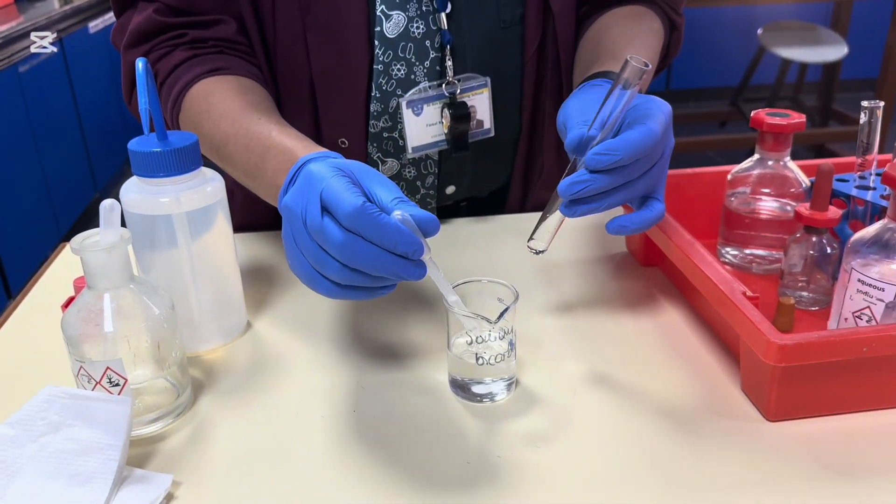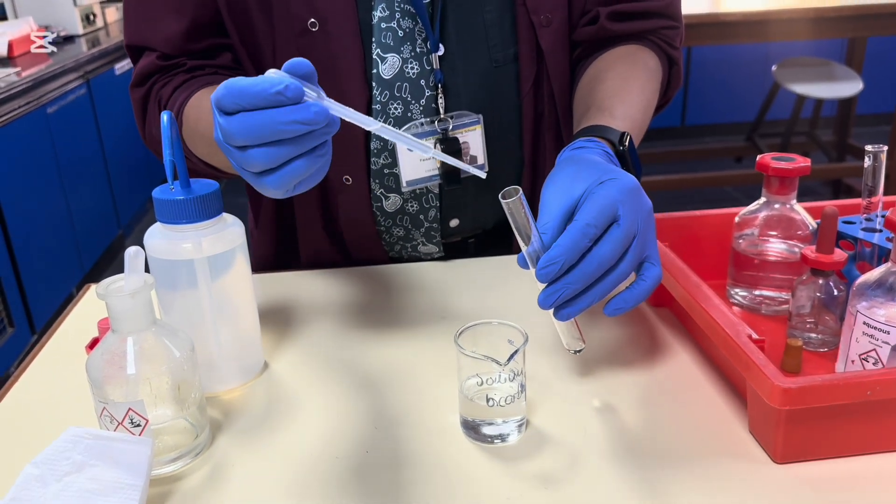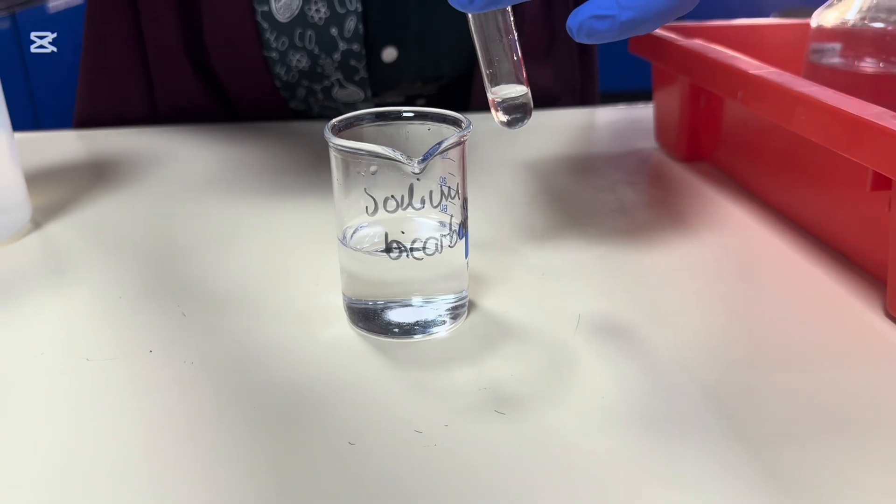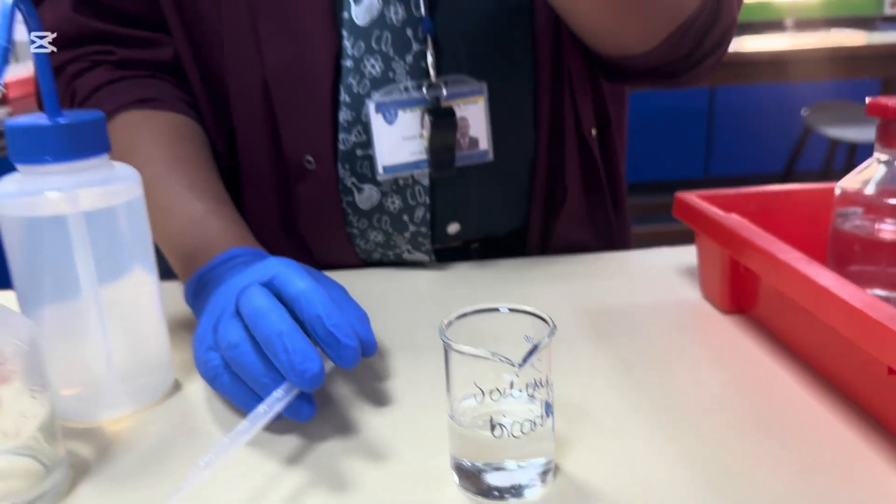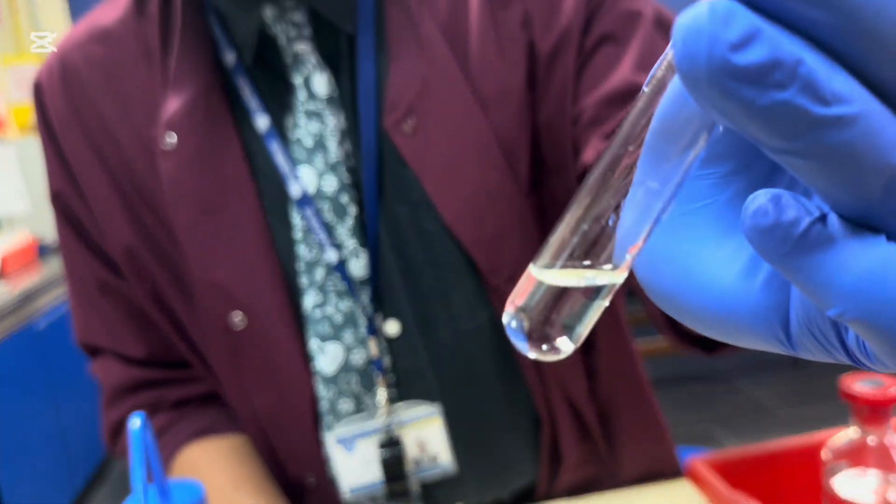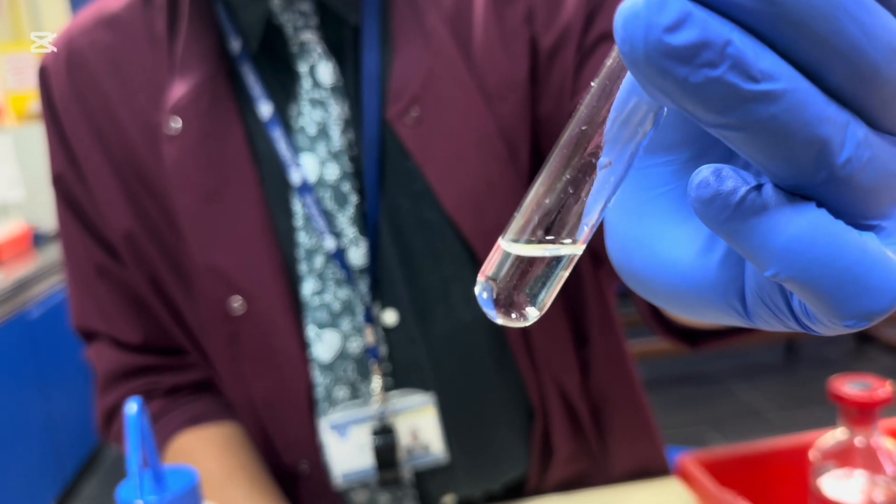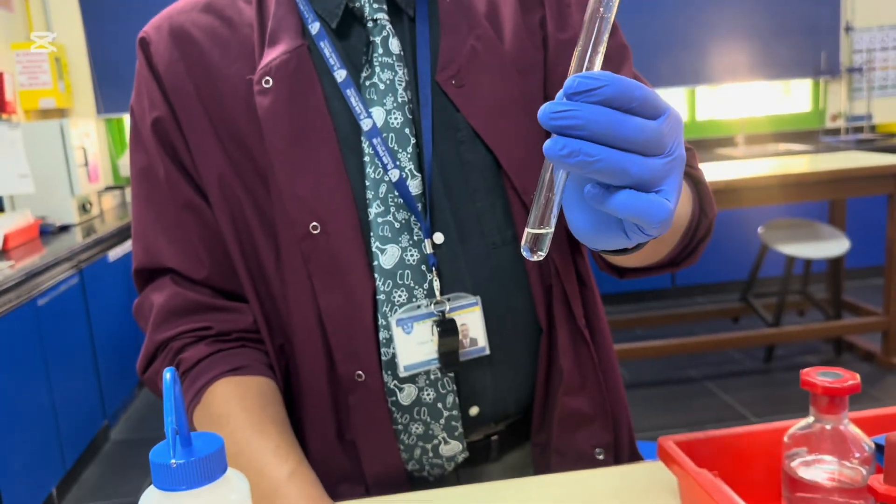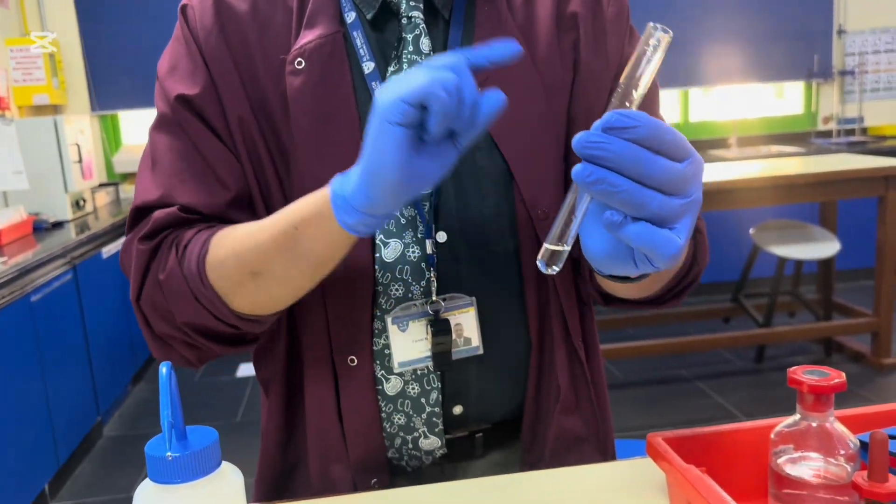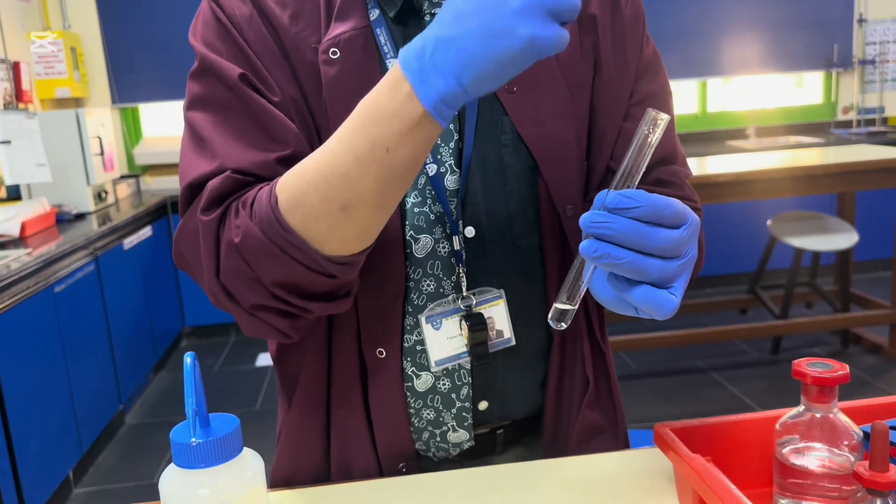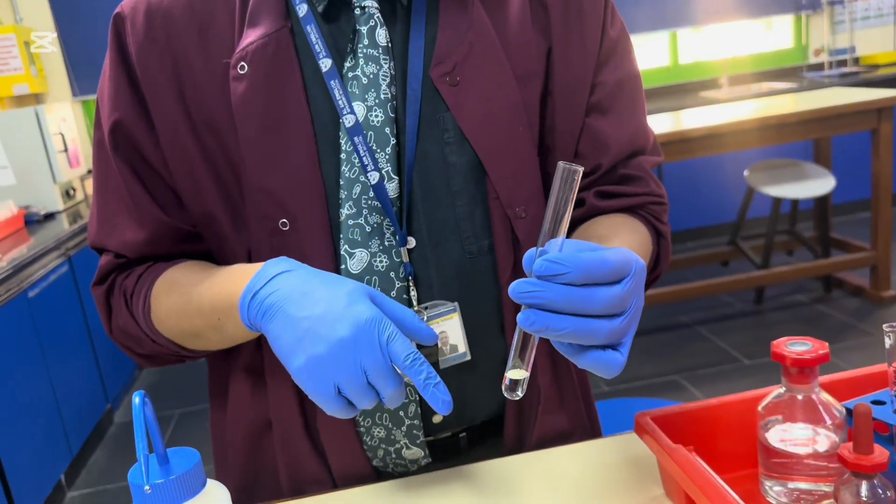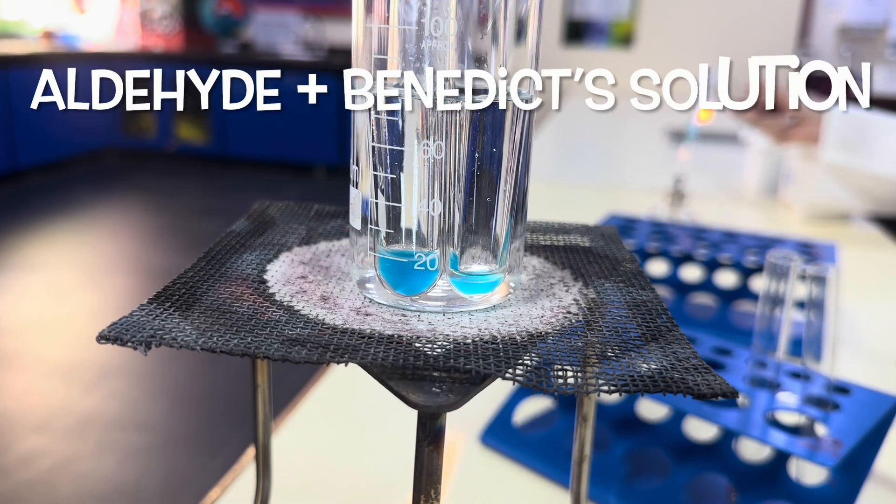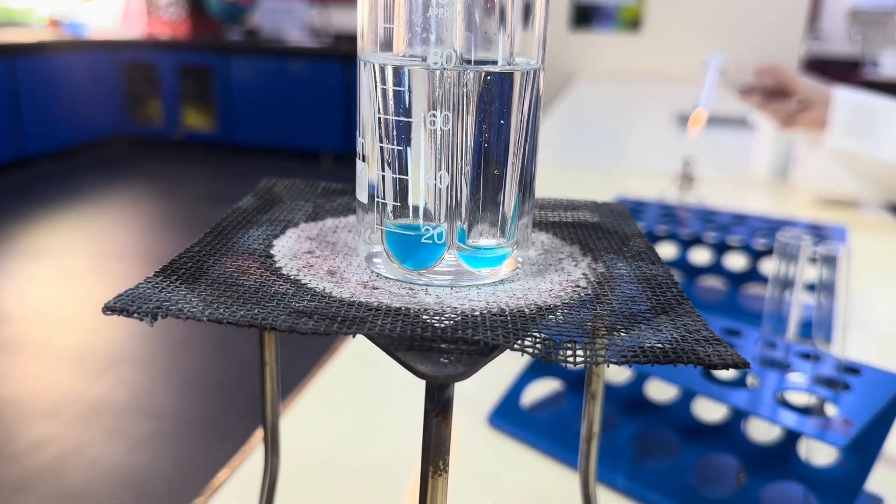Now what I'm going to do is I'm going to add a little bit to it. Now hopefully there is no fizzing. There's no fizzing, which is brilliant. That's good. That's good. That shows that the separation was successful and all of that gentle, this was, these guys didn't see it, but what I was doing was I was using ice baths just to make sure that everything was cooled down. It's a race Latifa. I'm going to see who gets it first. You probably will get it first because your technique is on point.